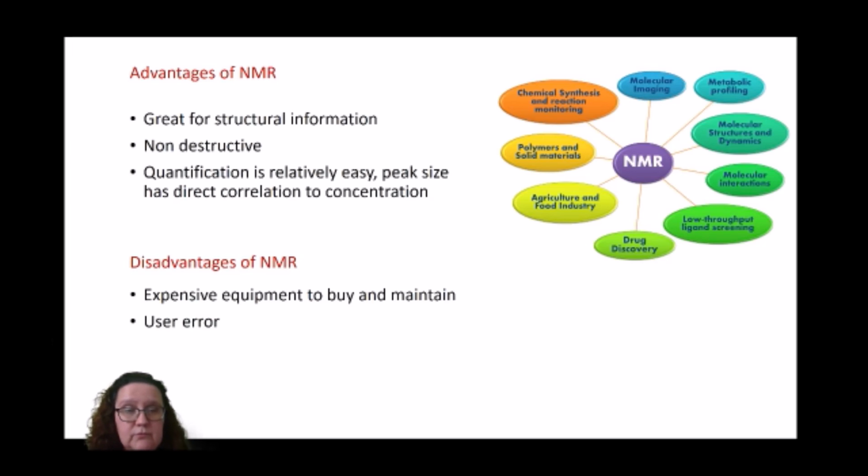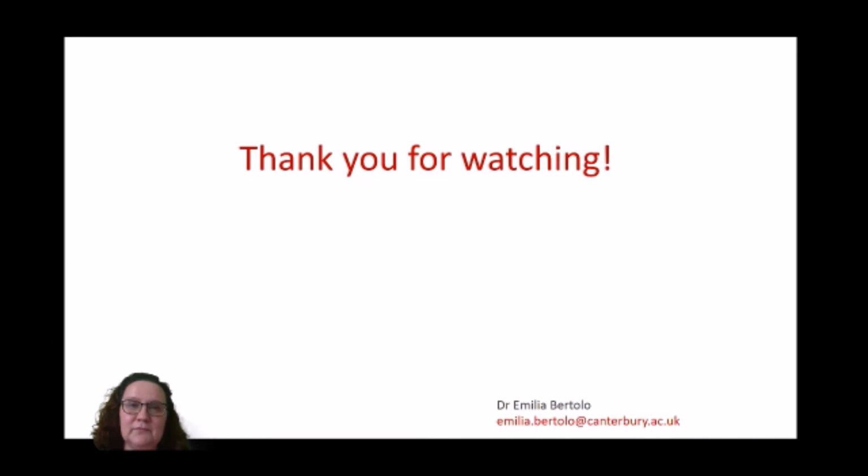As mild disadvantages, the equipment is expensive. Hundreds of thousands of pounds can be spent in buying and maintaining an NMR. And depending on how complicated the structure is, there's a great possibility for user error. So it does need an experienced scientist interpreting NMR, because they can get very complicated when you have a high number of carbons or hydrogens, depending on if you're looking at carbon or proton NMR, in the structure. So this is all from me.